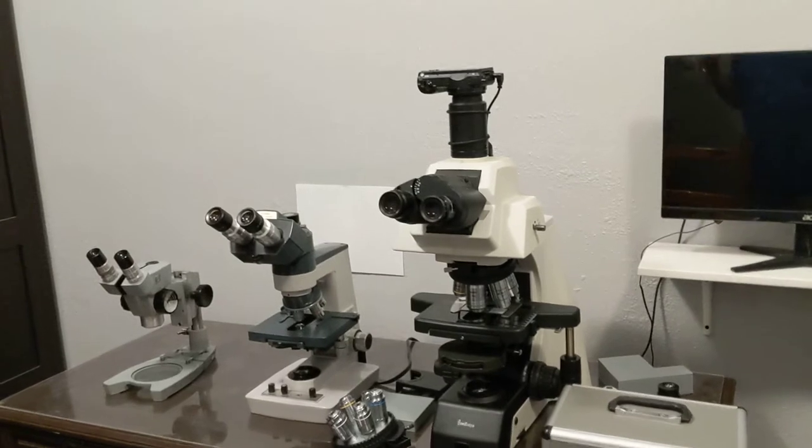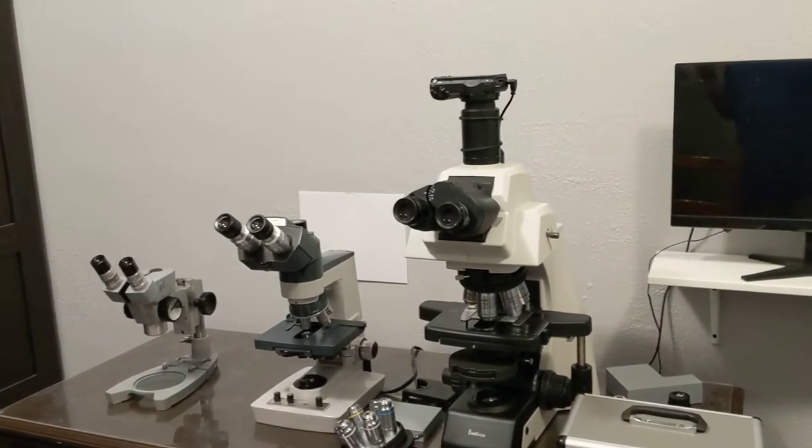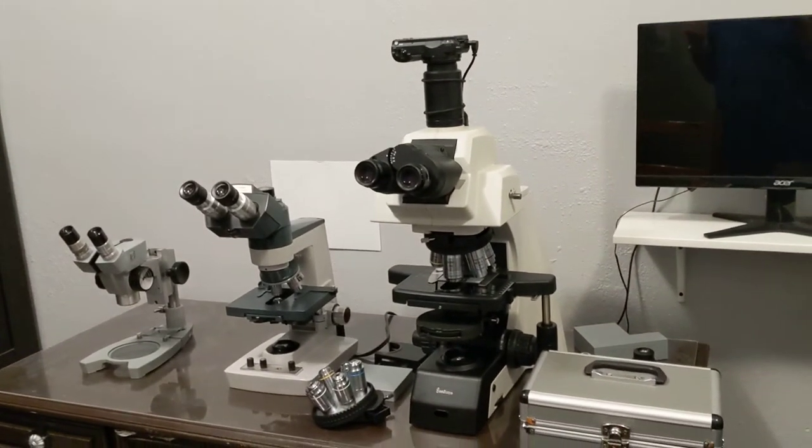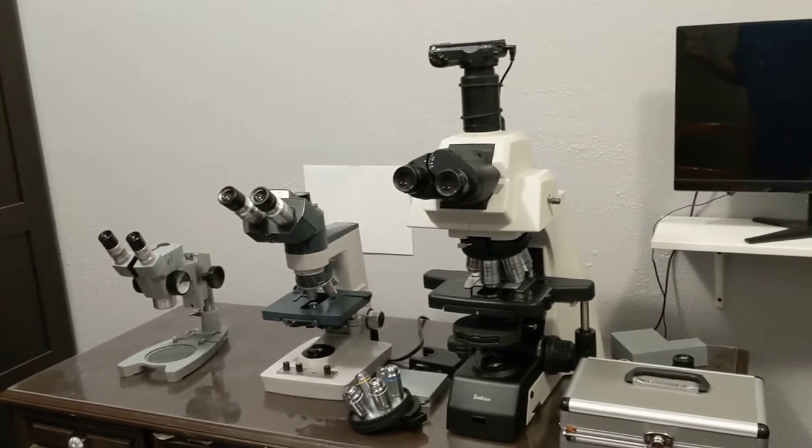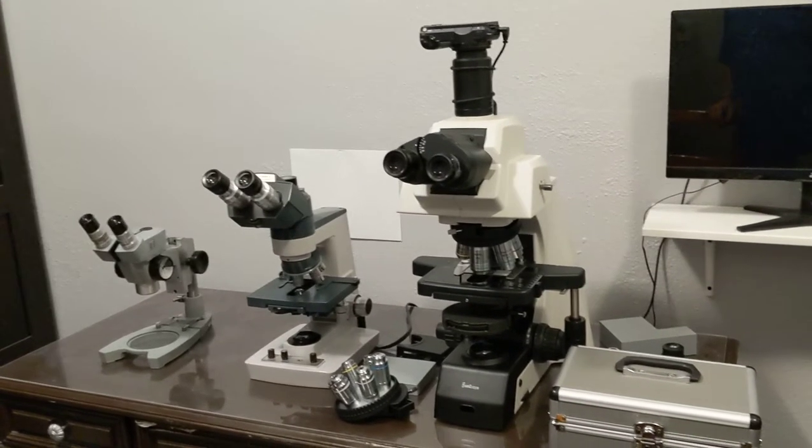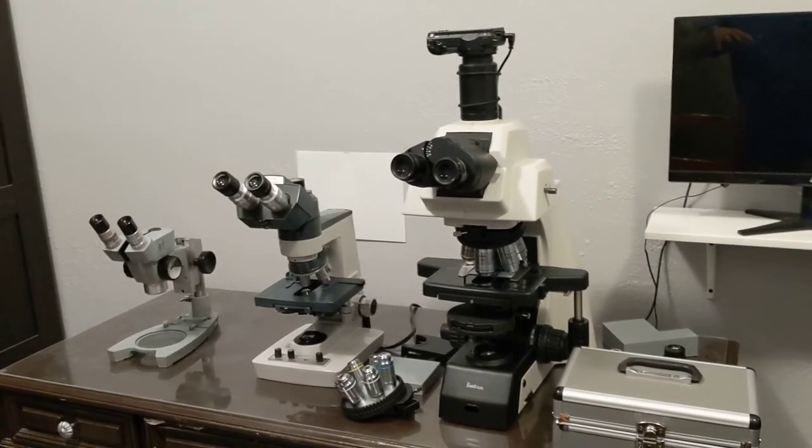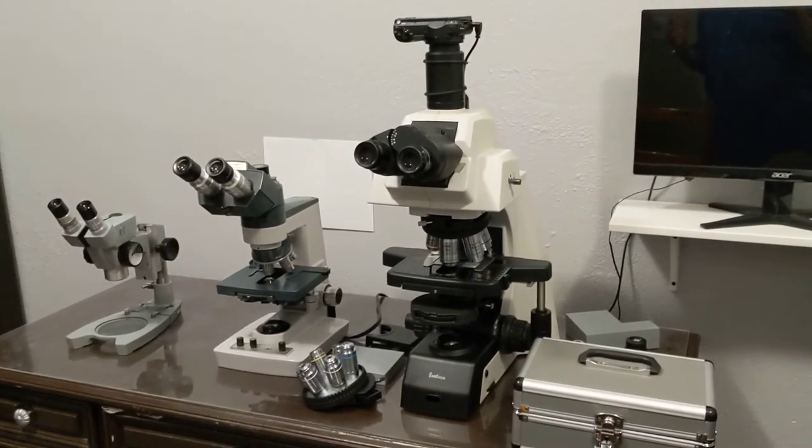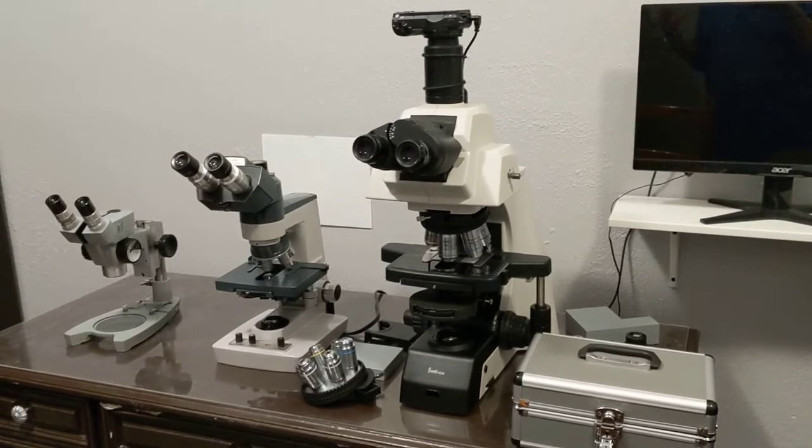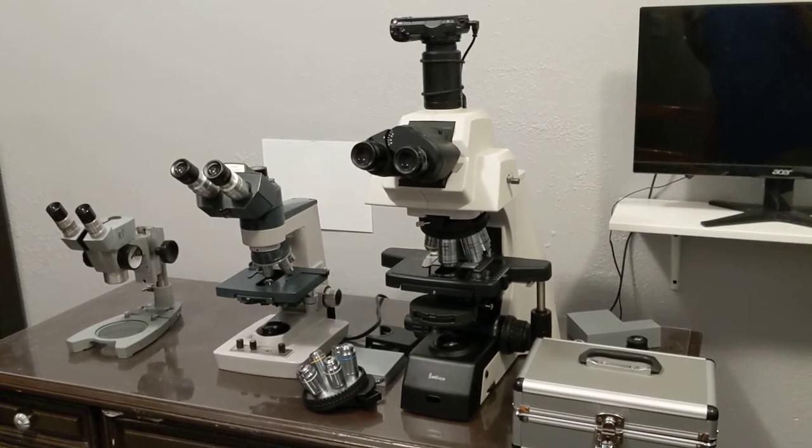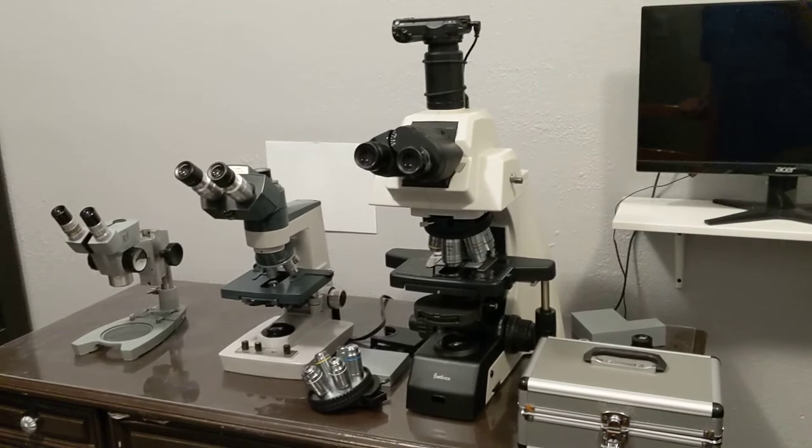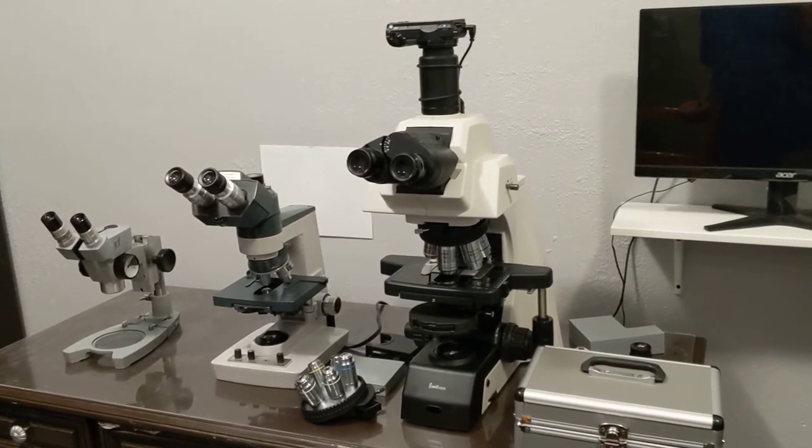Best Scope is a small microscope assembler and retailer located in China. I bought this microscope directly from China. They're very close to the manufacturer. There's very little markup between the actual origination cost and what it was sold to me for.